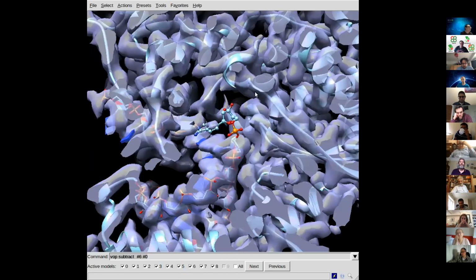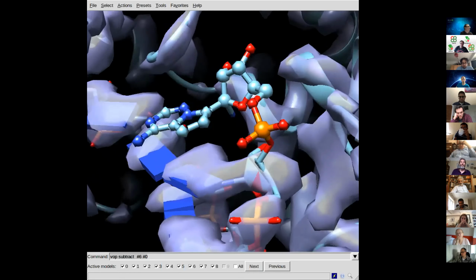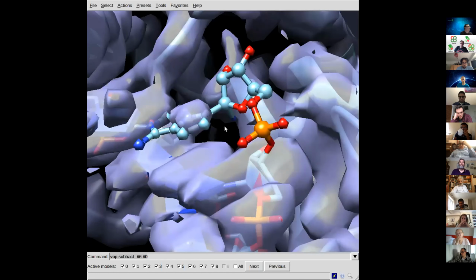I don't know if any of you know it. And it has the nucleic acid, but not the drug in it. And it also shows, at a low density comparable to our Remdesivir map, some density at the same nucleotide position.